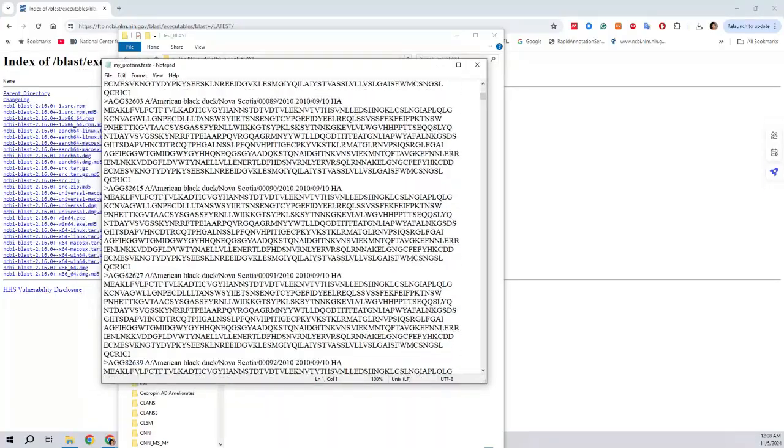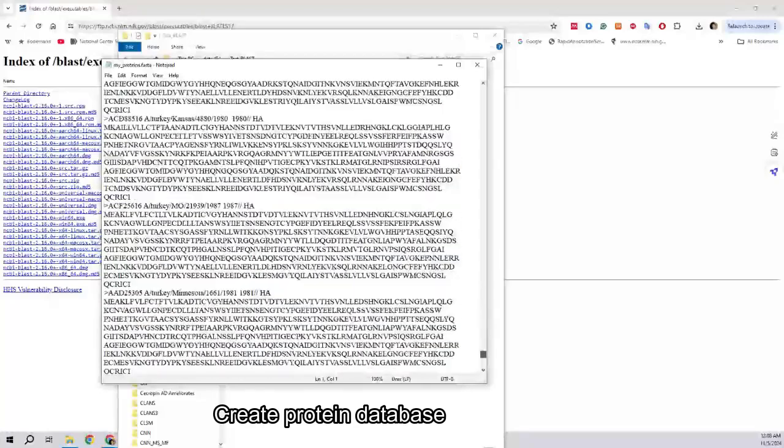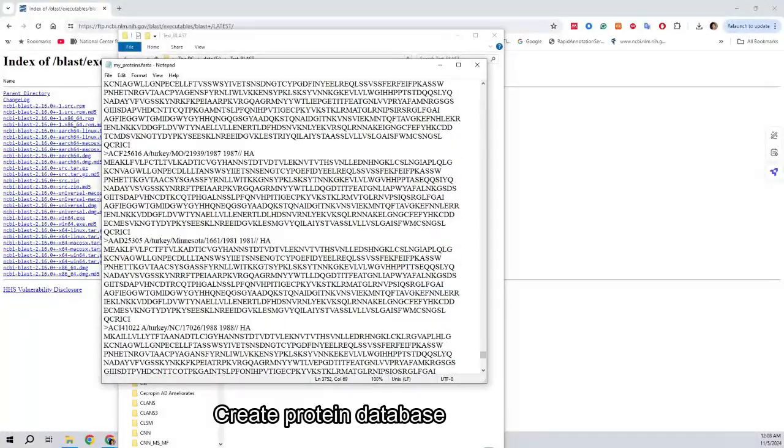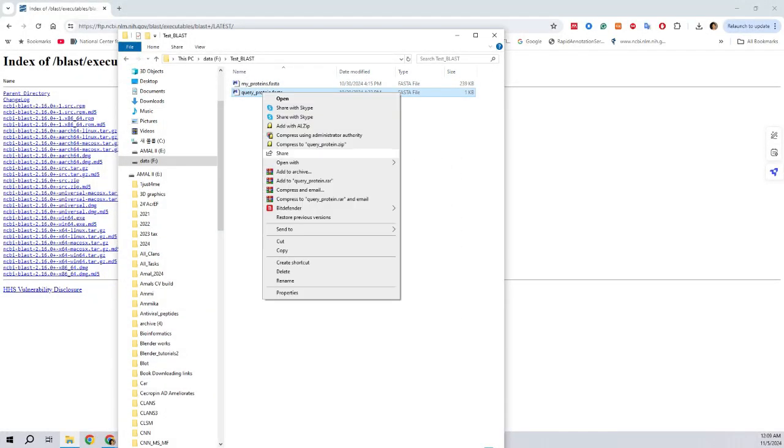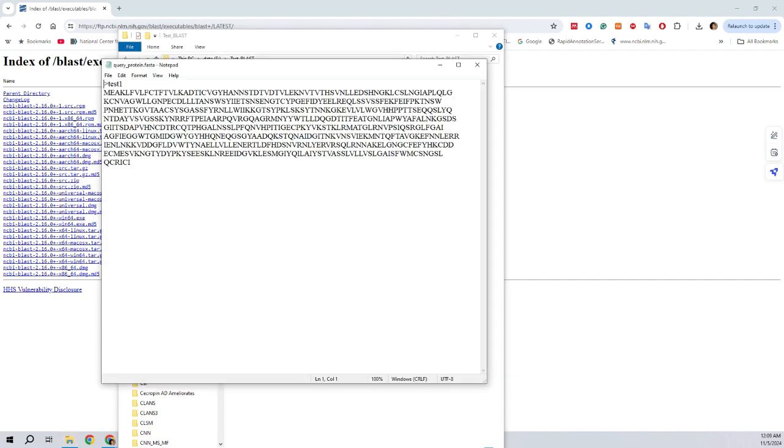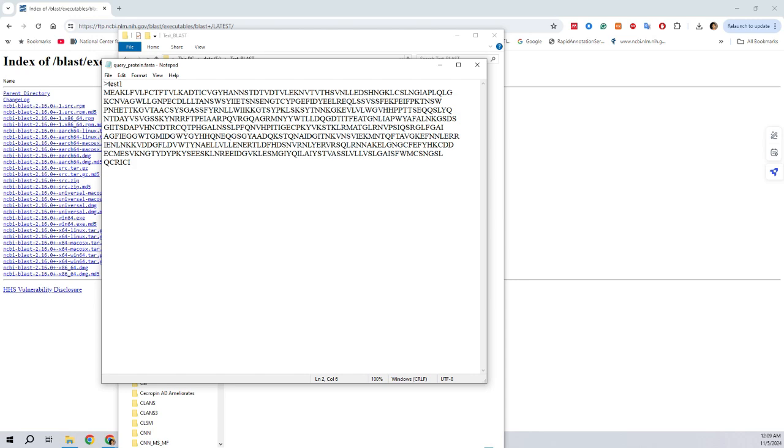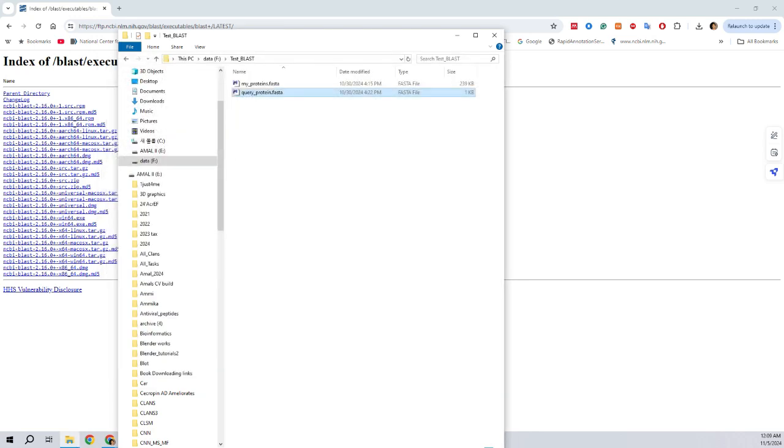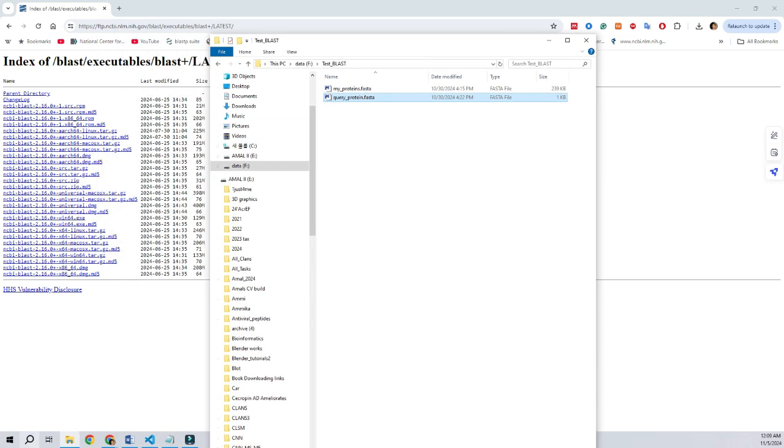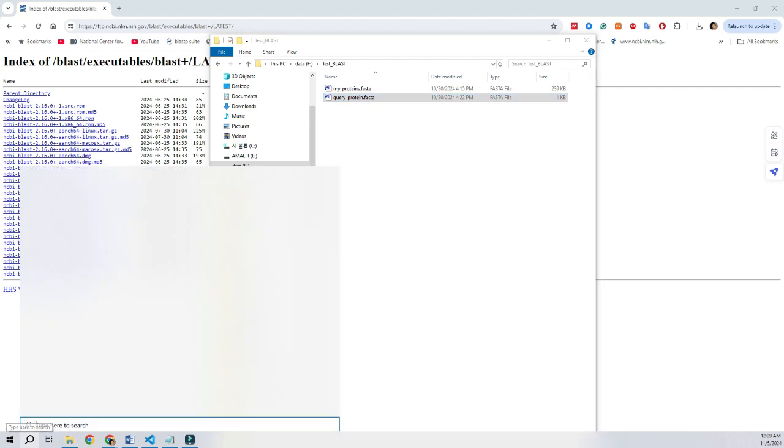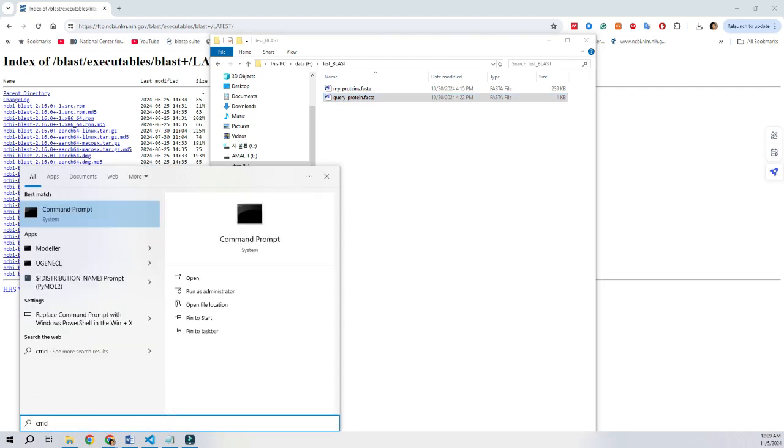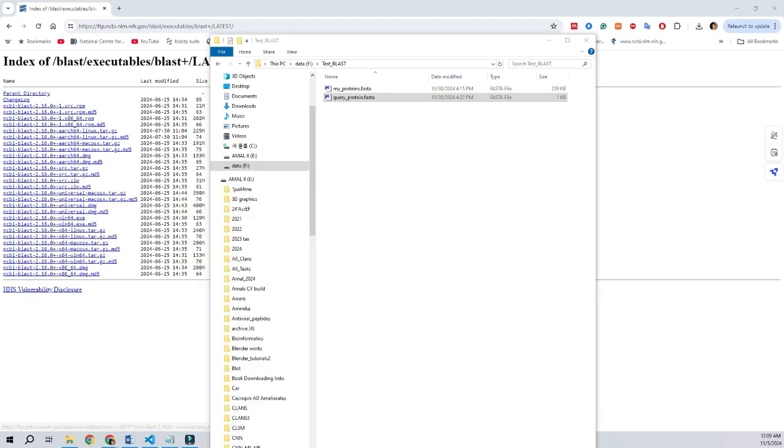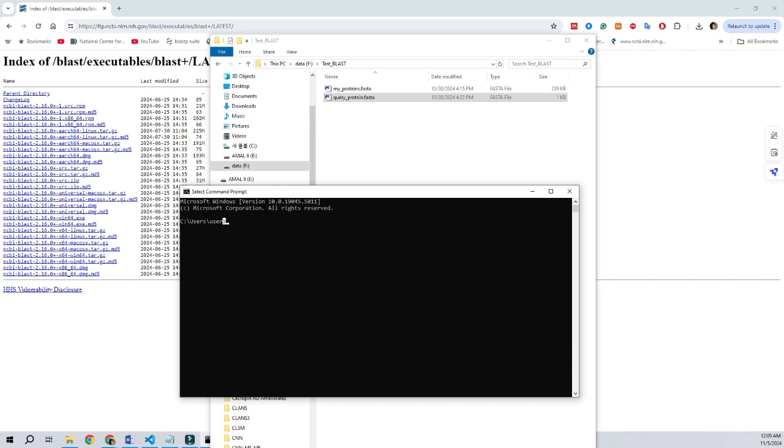The next step is we have to construct our custom database. This database can be any set of sequences, protein or nucleotide sequence in FASTA format. For this tutorial, we will be confined to proteins, or if we prefer, we can download NCBI's database. But we have to keep in mind that the database in the NCBI is pretty large. At least we have to have 160GB of space to download the large NCBI database. For this tutorial purpose, we are going to create our own database.